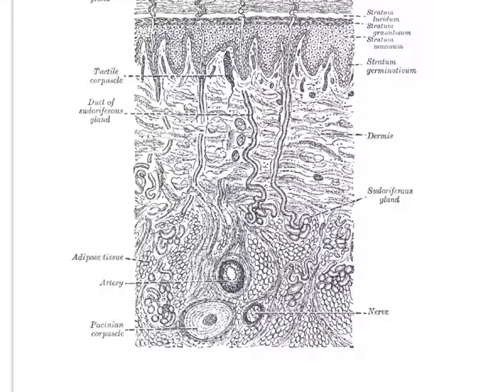Also the Meissner's corpuscle. Okay, so now I'm going to have you return to the lowest magnification, the red one, and try to position your slide back in the middle there, so the next person can find everything. And then turn your microscope off.